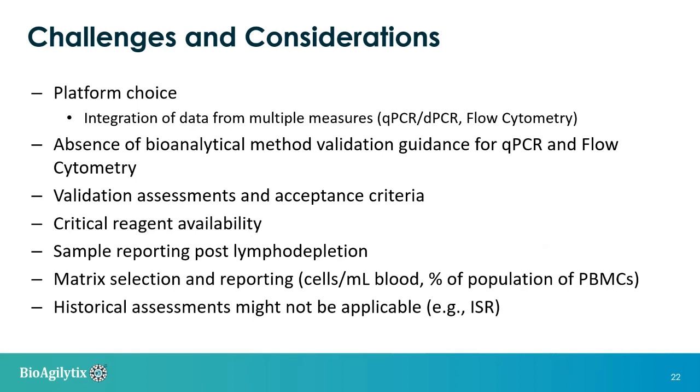And finally, another challenge with PK assessments in this space is assessments like incurred sample reanalysis. That's a historical PK assessment. Sometimes it's difficult and challenging to reproduce in a molecular setting and in a flow cytometry setting for that matter. So it causes a lot of confusion in the industry as well.